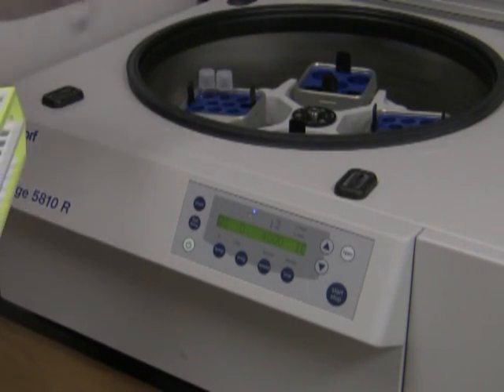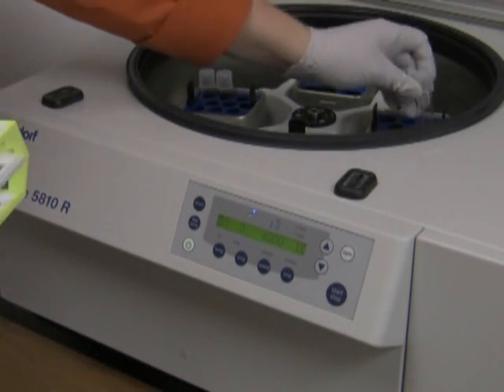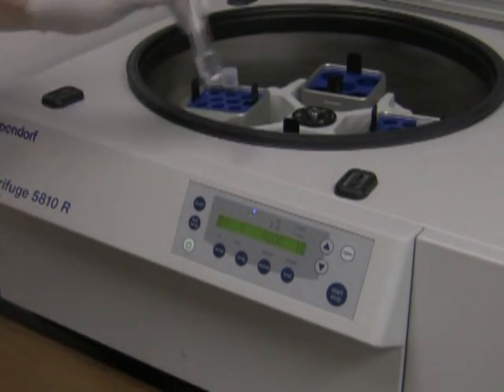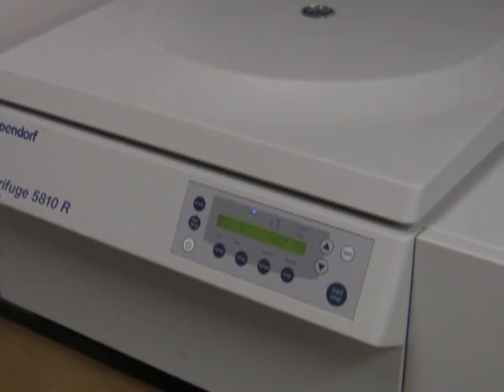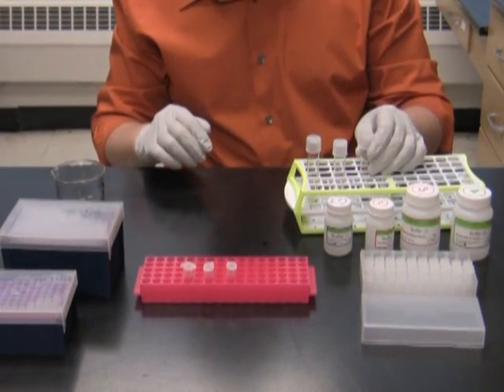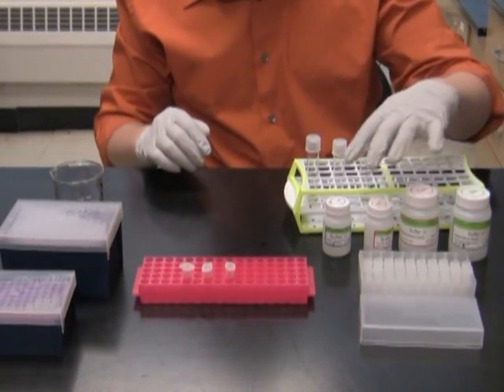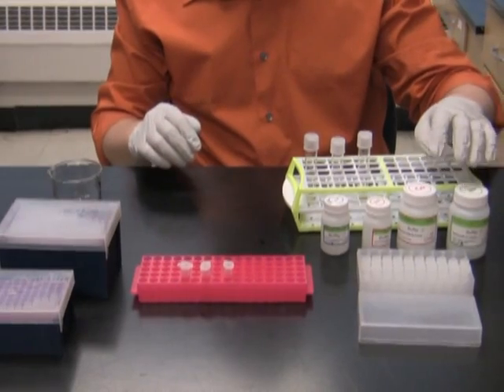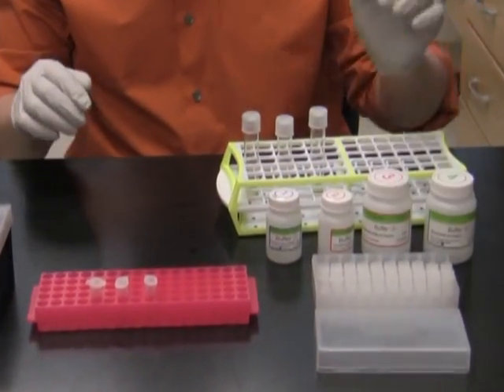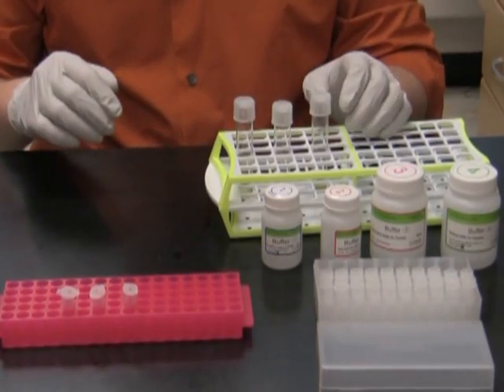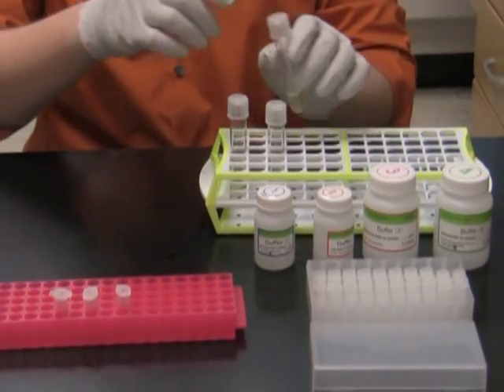Here I have pelleted cultures and right now I'm going to use a standard mini prep kit, which in this case is a Pionier kit, which consists of several buffers and columns to isolate the plasmids. I start by discarding the supernatant from each of the tubes.